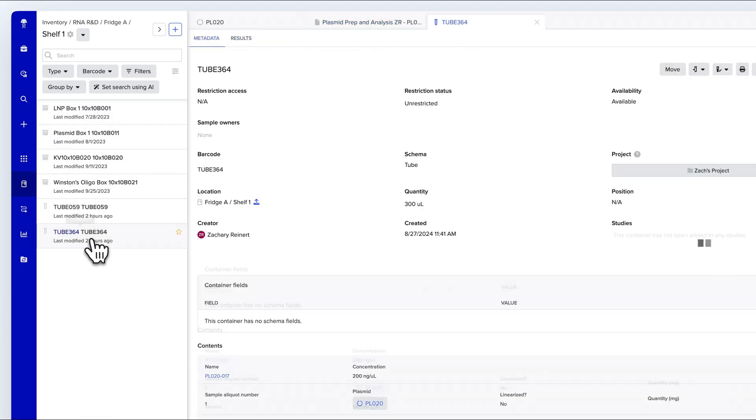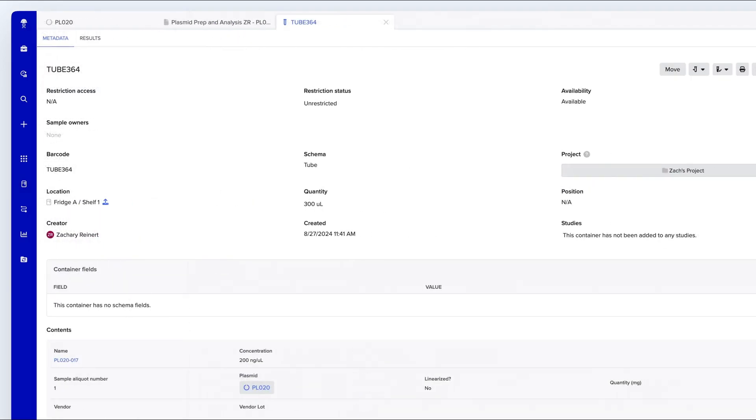You'll see all the relevant information such as sample owners, quantity, location, contents, and barcode.